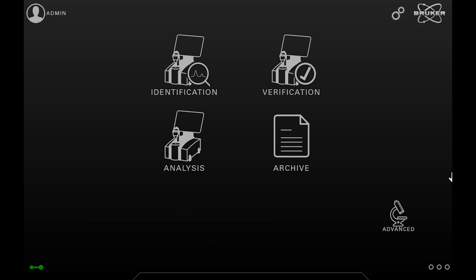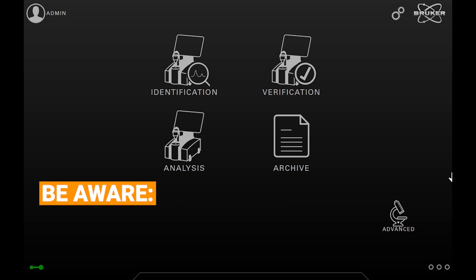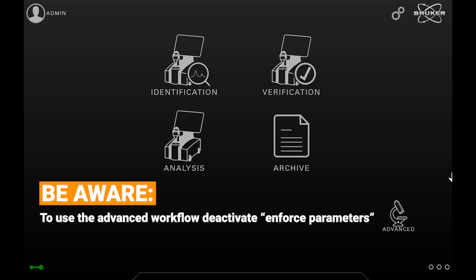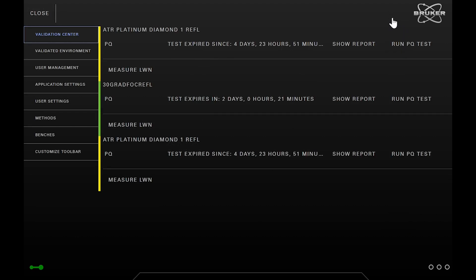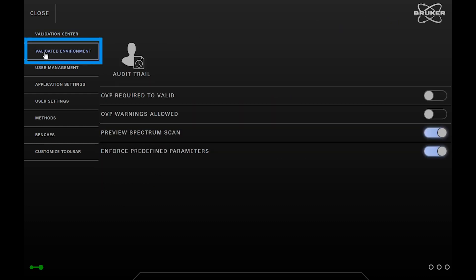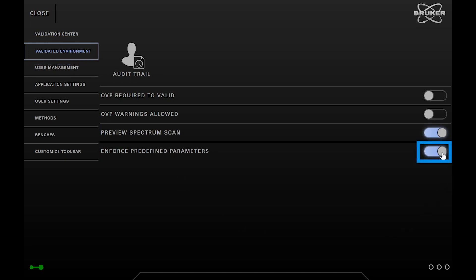Before we open the dialog, we will first deactivate the predefined parameters in the settings in order to see all possible parameters. For that, open the settings and navigate to the validated environment tab. Then deselect enforce predefined parameters. When done, close the settings.